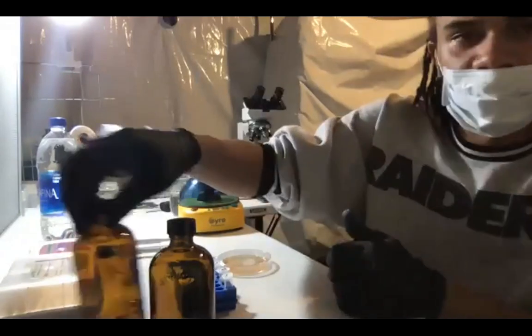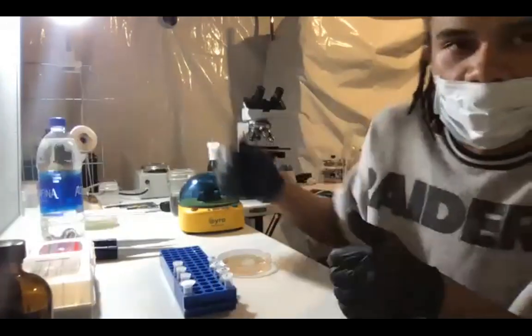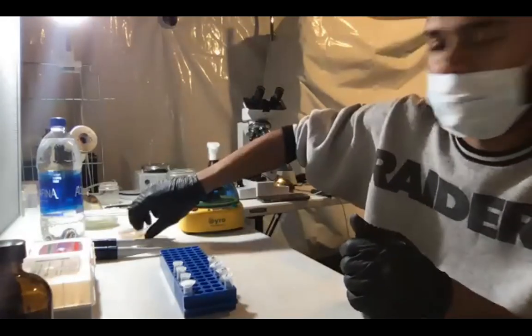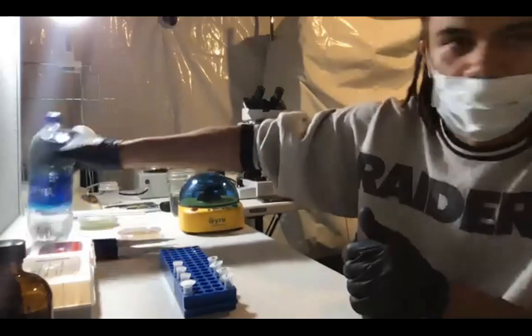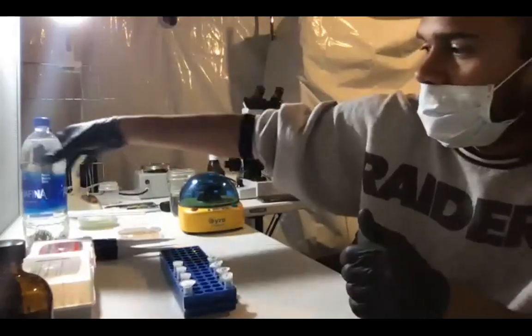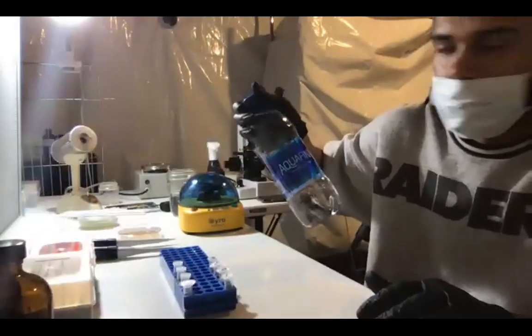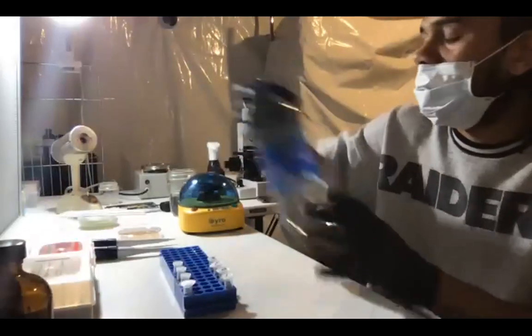And I found this to work really well. I've never needed to buy molecular biology grade water, and I have good reactions. I would buy it if I had more funding, but I'm doing this all by myself. So Aquafina really works really well. You're gonna get good results. Just make sure that for each run, you have an unopened bottle.